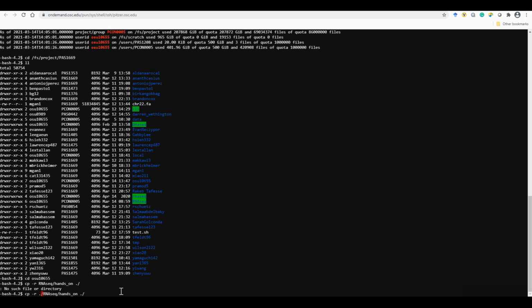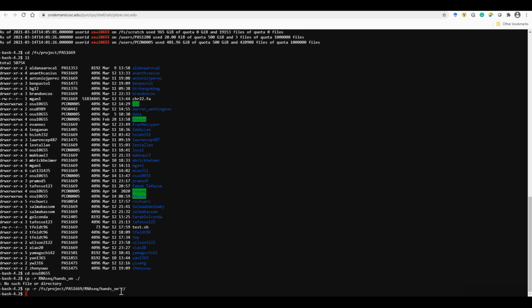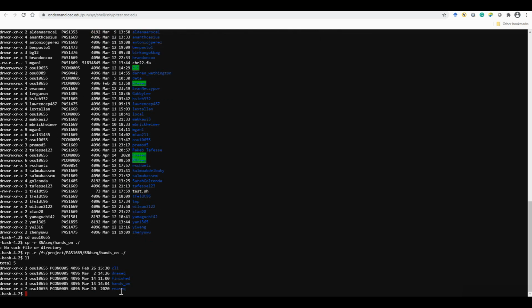Oh, I see. Because I'm in my own folder, let's use the absolute path. Okay. Now the hands-on folder is already within my own folder. And let's take a look what's inside.